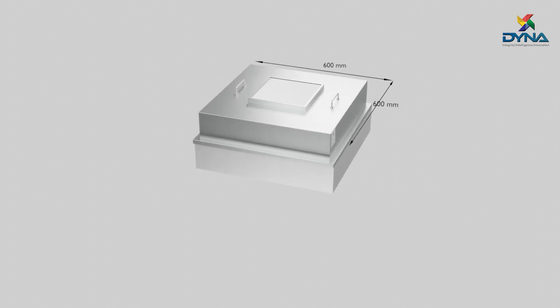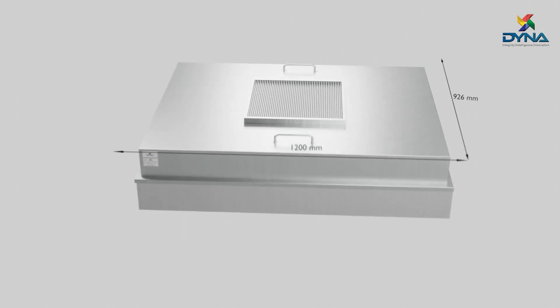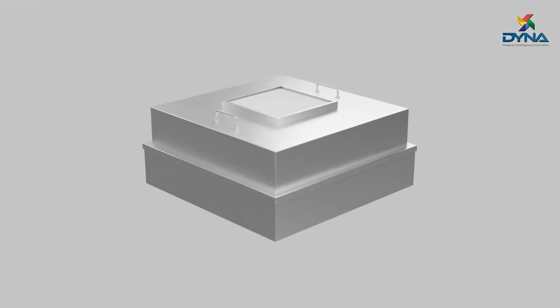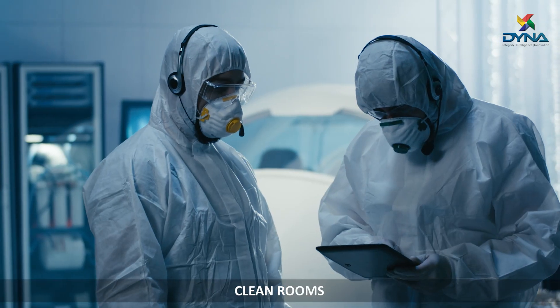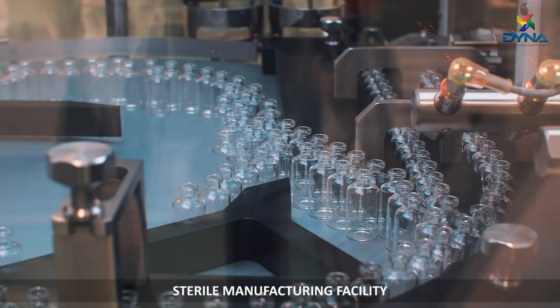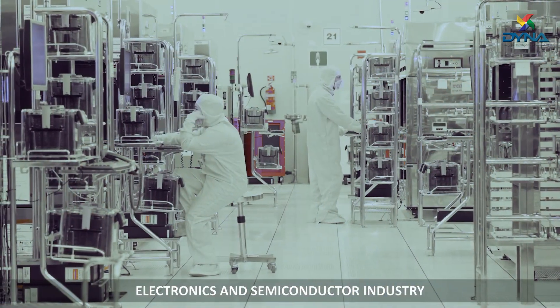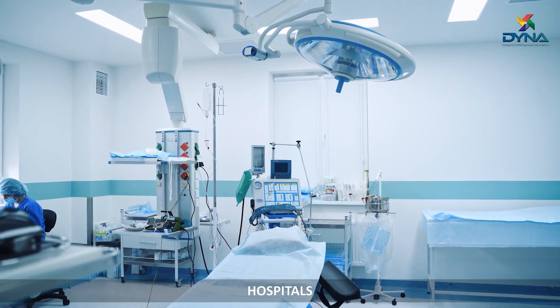The fan filter units can be made with varying sizes and configurations as per the project requirements. These fan filter units can be used in all types of clean rooms, data centers, sterile manufacturing facilities, electronics and semiconductor industries, hospitals, and more.